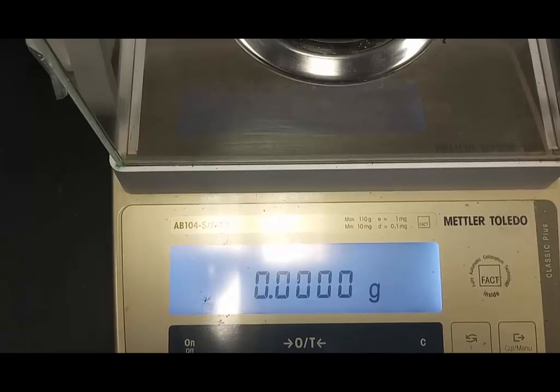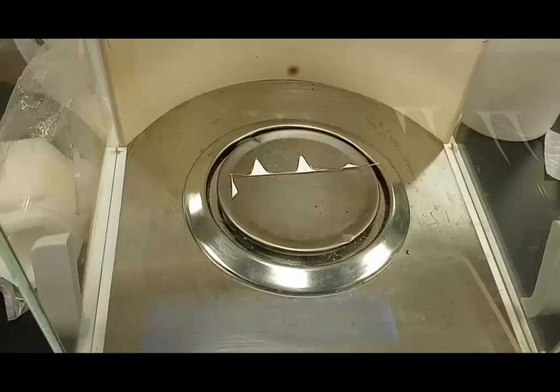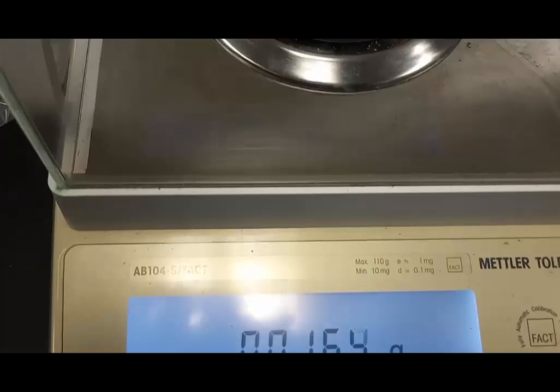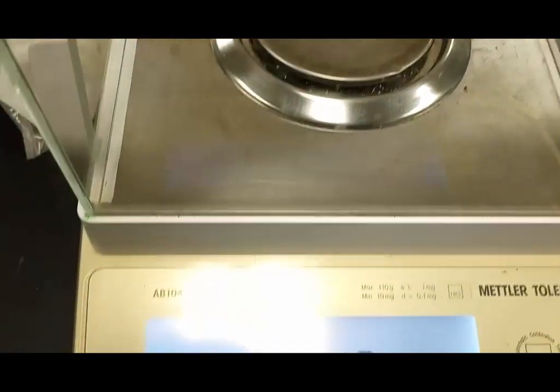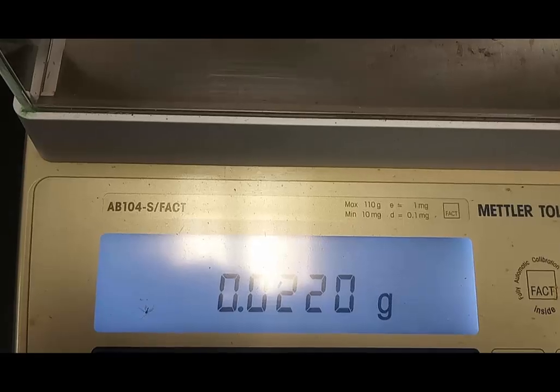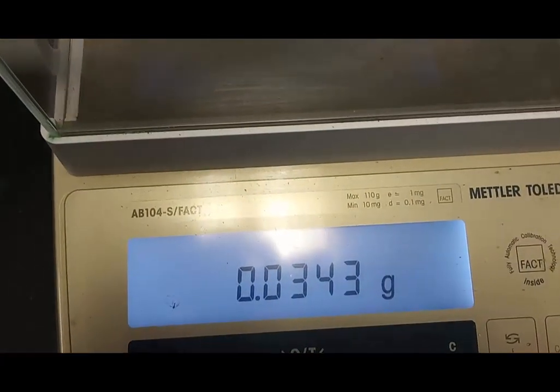We will now weigh each of the peaks in turn just to see how much mass is involved in the paper. The quartet on the weighing pan weighs 16.5 milligrams, 16.6. The nonet on the weigh pan is weighing 22 milligrams. The doublet worth 2 on the weighing pan weighs 34.3 milligrams.